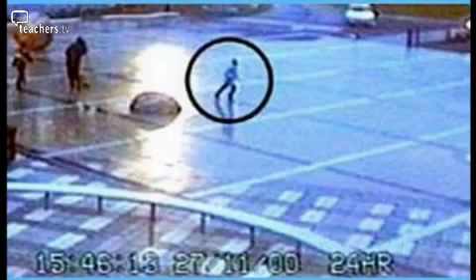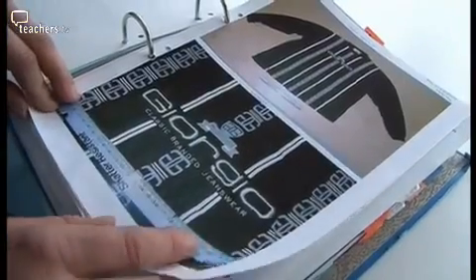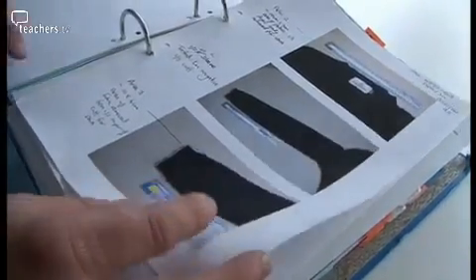There were two highly publicised trials in the Damilola Taylor case, which had not yet led to any convictions. The police approached our laboratory and they wanted us to re-examine the case. In the end, I had 20 lever arch files like this, which contained DNA profiling results and my statements. We were asked to examine a lot of items of clothing and footwear from the suspects in the case. We looked at a black sweatshirt from another suspect and we found a blood stain on the cuff of that black sweatshirt. In this case, we used a test called luminol.